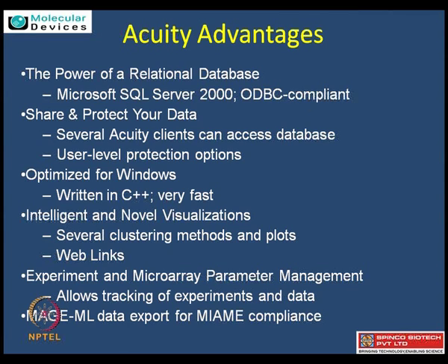There is a MAGE-ML data export. What happens is, as we discussed different QC formats, this particular MAGE-ML is based on the MIAME requirements, which says what all is required and how to do it for the microarray experiment. This has a direct export capability of that. So this gives one a very good opportunity, not only from the data to the export at different levels.